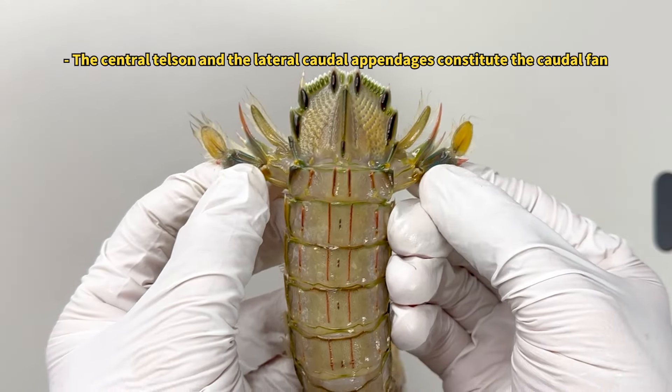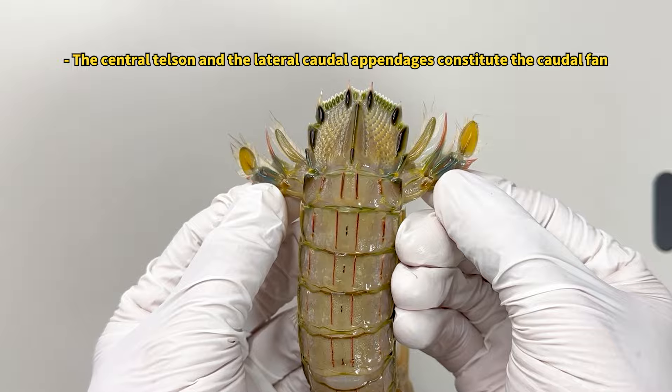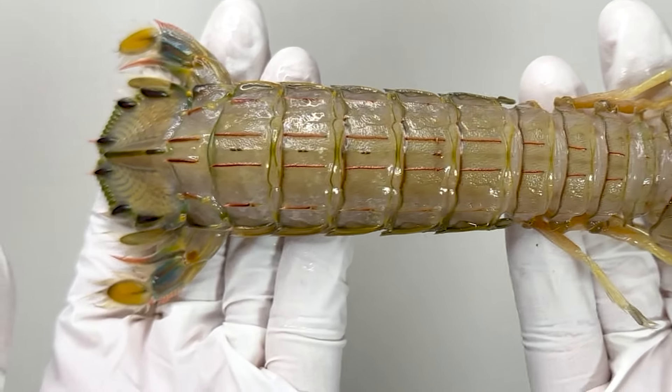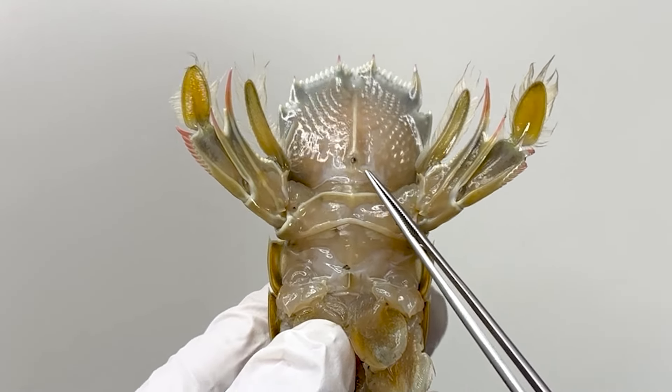The telson at the end of the body, along with the caudal appendage, forms the tail fan. The tail fan is a distinctive feature of the Japanese spear lobster, noted for its vibrant colors. This opening on the underside of the tail is the anus of the mantis shrimp.